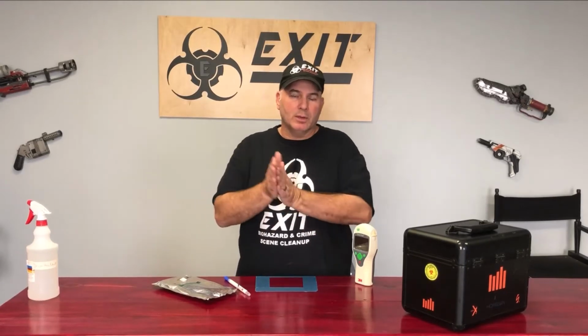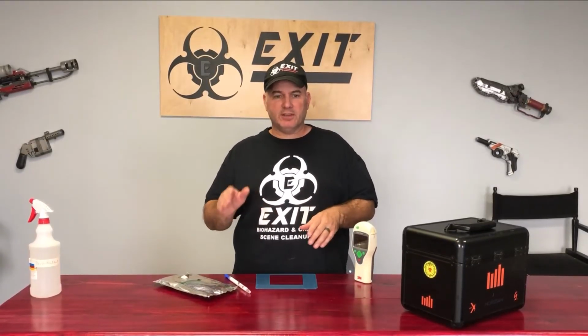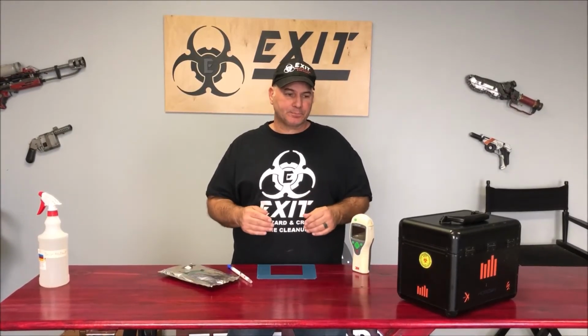Now, for our purposes in our remediation company, we use this as an internal test to test certain areas to see how we are doing. A lot of times it's great to have a before and after, to determine how well we did or how well our disinfectants are working and things like that. This is a 3M unit. There's other units out there. There's Hygiena. There's a couple other ones.